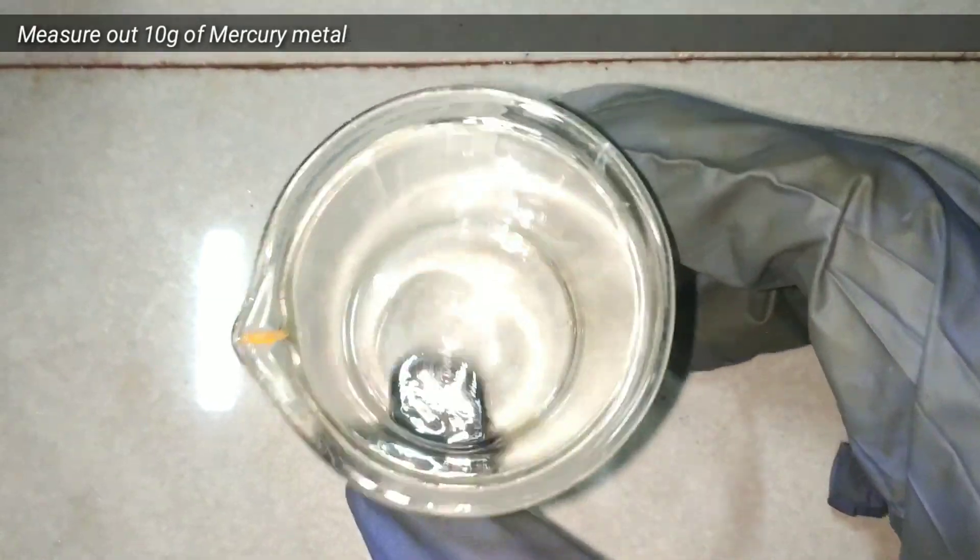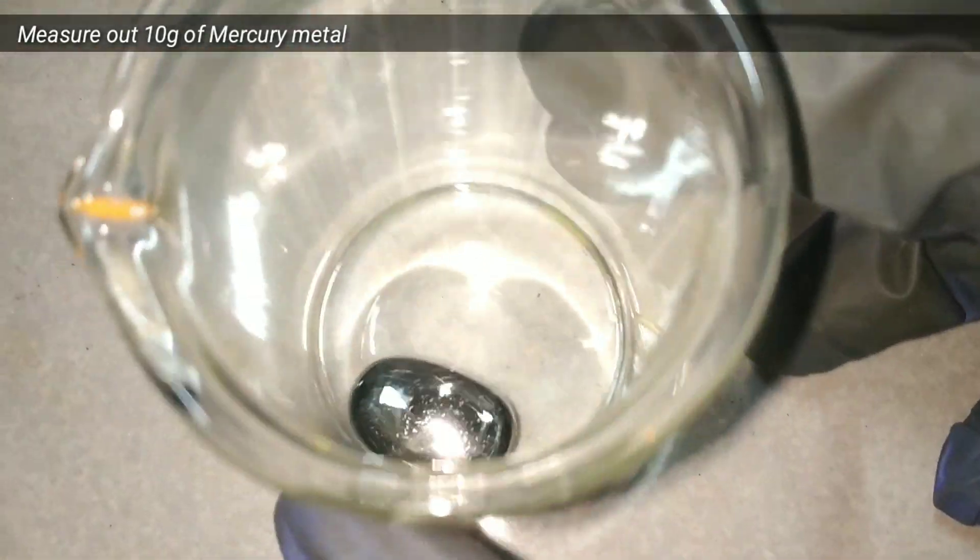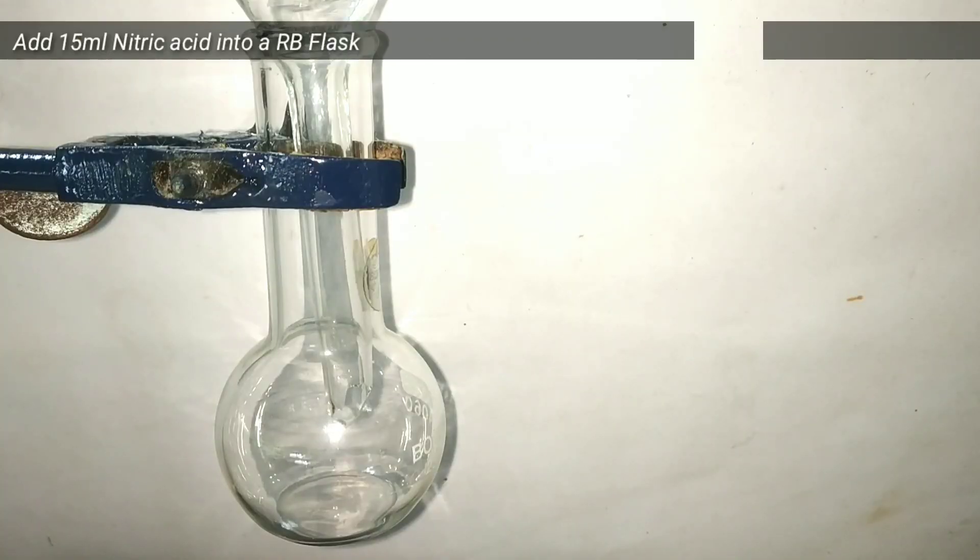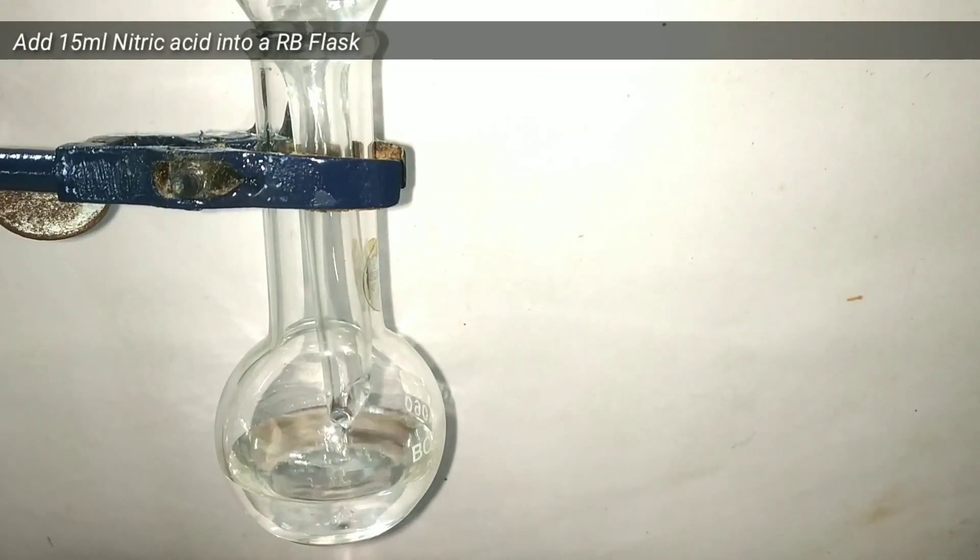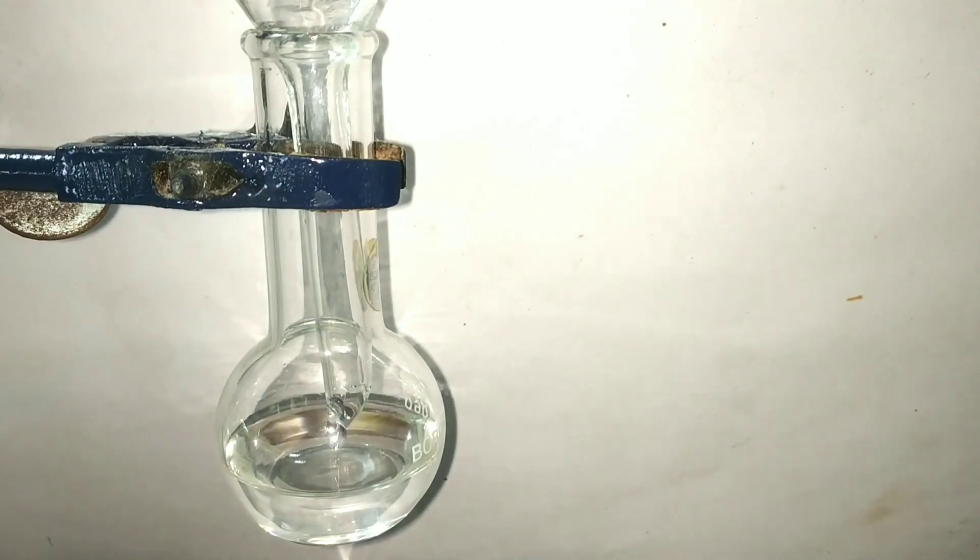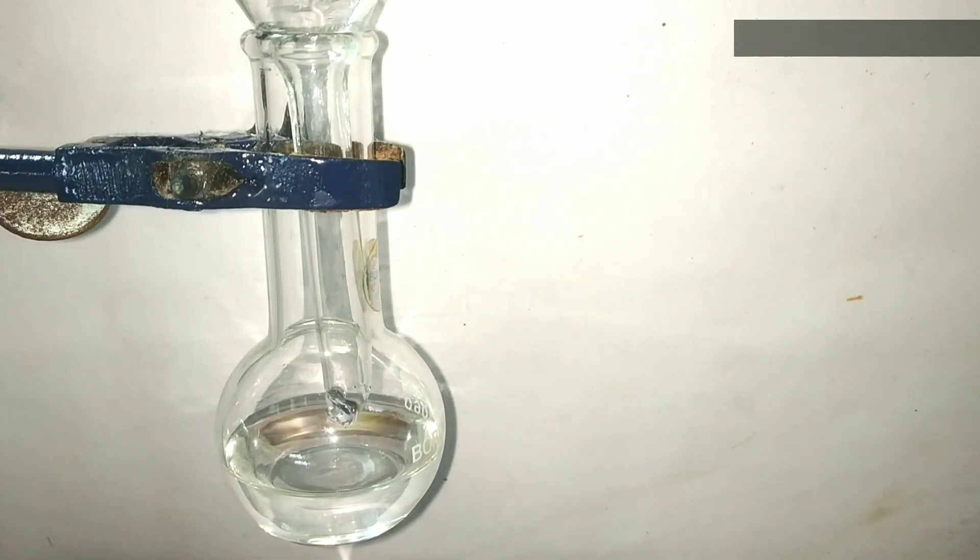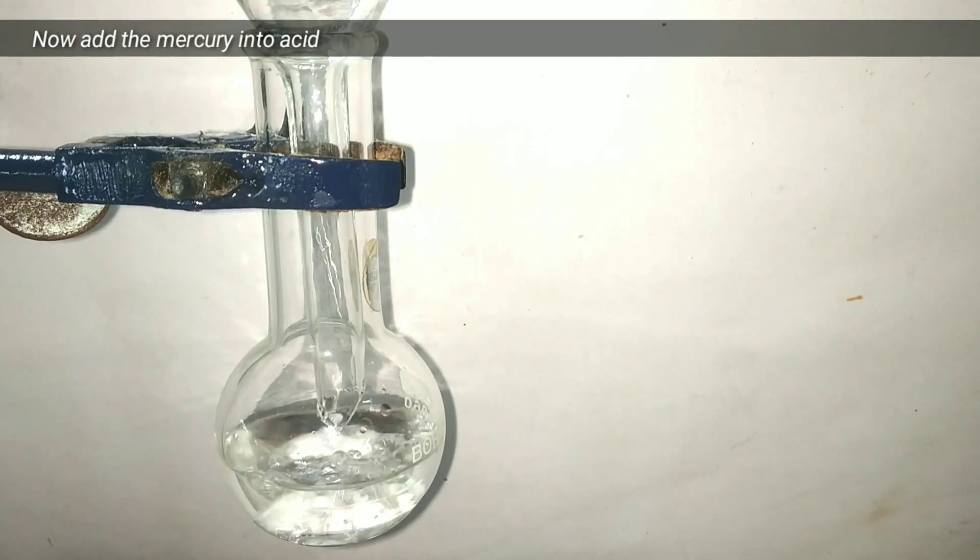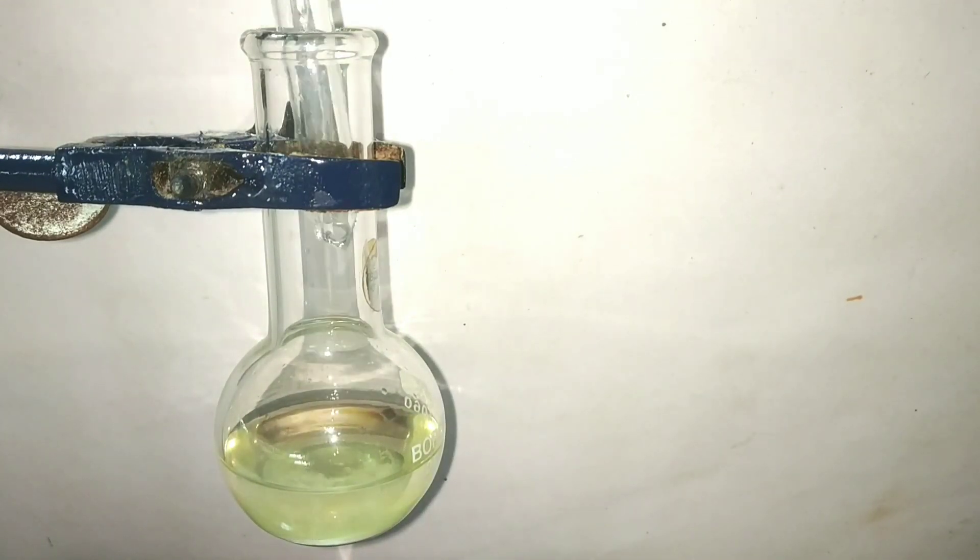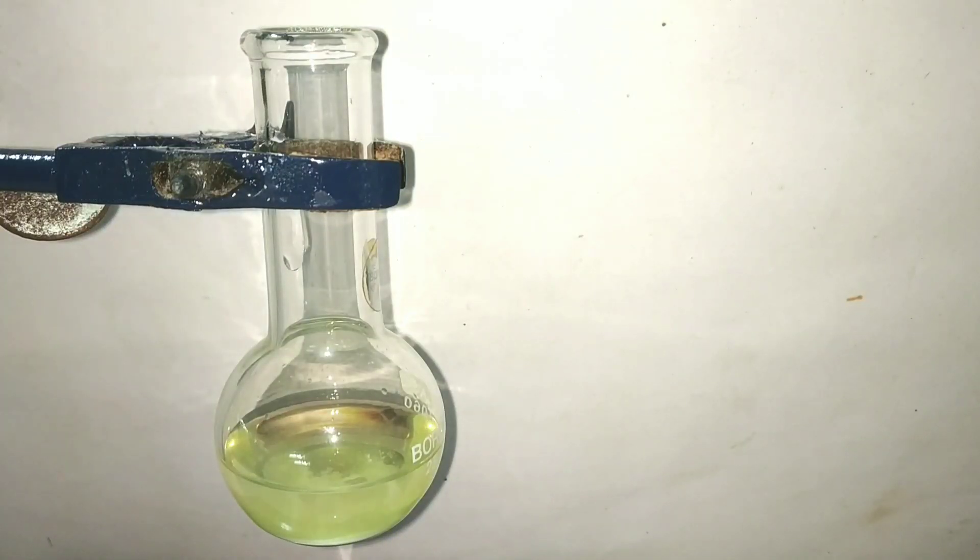Start by measuring out 10 grams of mercury metal. Mercury, as you know, is a metal that exists in the liquid state at room temperature. Now we add 15 milliliters of concentrated 70% nitric acid into the round bottom flask. Into that, we add the 10 grams of mercury metal. Immediately upon addition of the metal, you can see a bubbling and yellowish brown discoloration of the contents of the flask.